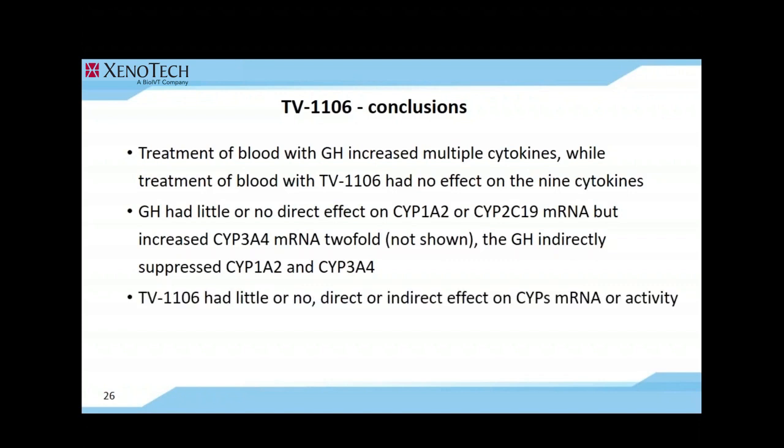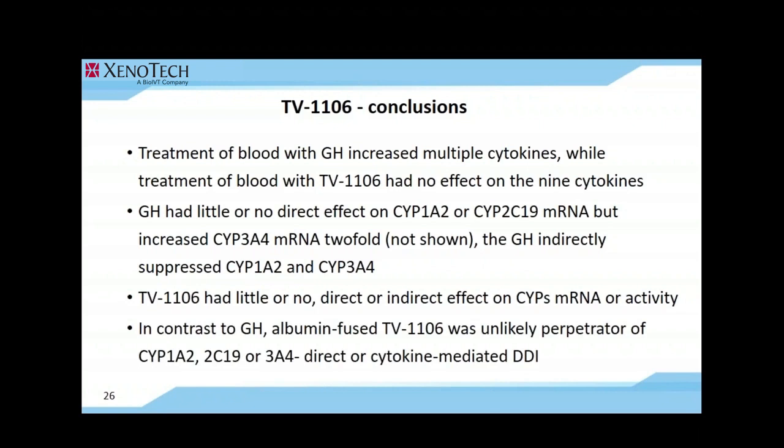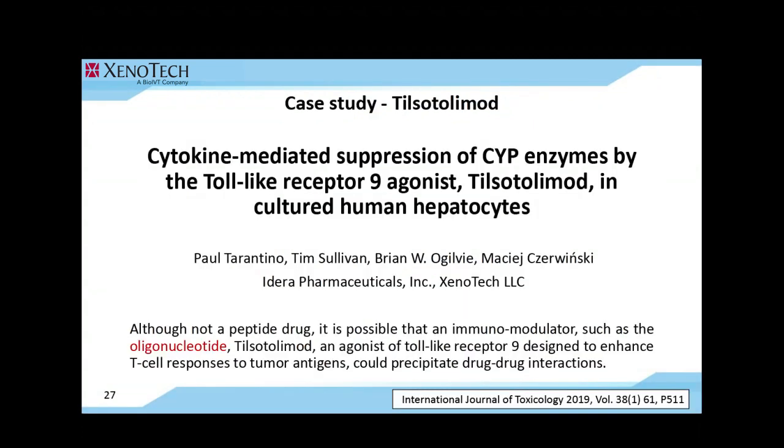TV1106 had little or no direct or indirect effect on CYPs mRNA or activity. Therefore, in contrast to growth hormone, albumin-fused TV1106 was unlikely perpetrator of CYP1A2, 2C19 or CYP3A4 direct or cytokine-mediated DDI. Our last case study is that of tilsotolimod.